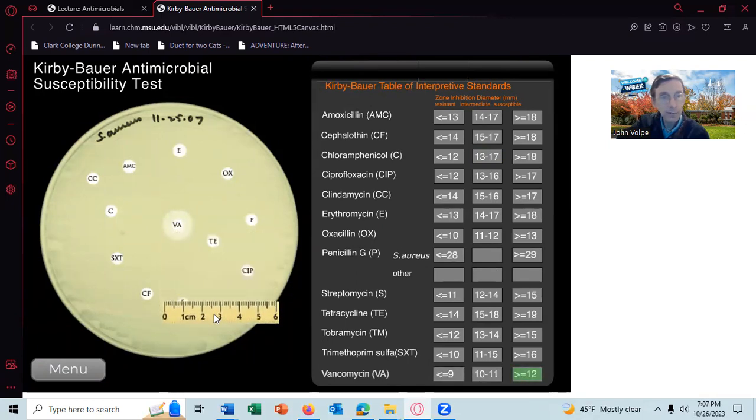All right, any question? For S, what you do is you just measure the zone of inhibition, and there isn't one, so you just measure the disc, but that would be about 6, and that's S for streptomycin, so it's resistant. That's green, that's right.